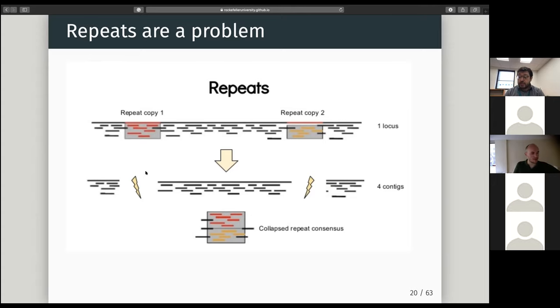And this is particularly due to Illumina technology. So Illumina is a short read technology, about 150 base pair sequences. So the decrease in cost and the increase in throughput has been spectacular with Illumina. But somehow, as you mentioned earlier as well, it hit a technical limitation for genome assembly.